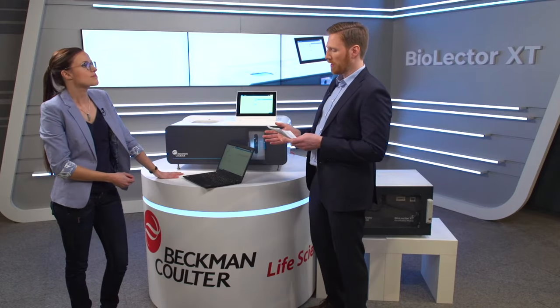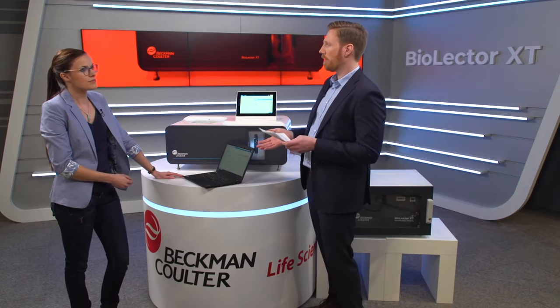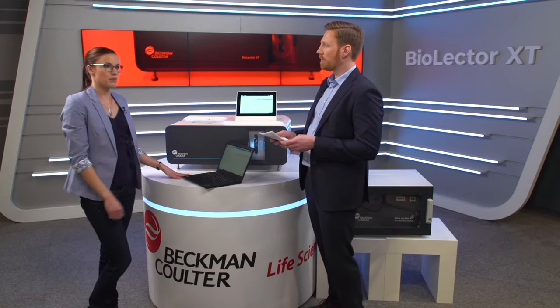That's pretty quick and easy. What else do you need to prepare? Well, now you have to set up your protocol, which is really flexible. You can choose, for example, whether you run experiments in a constant, linear, exponential, or pulsed feeding manner, or any custom combination of these.